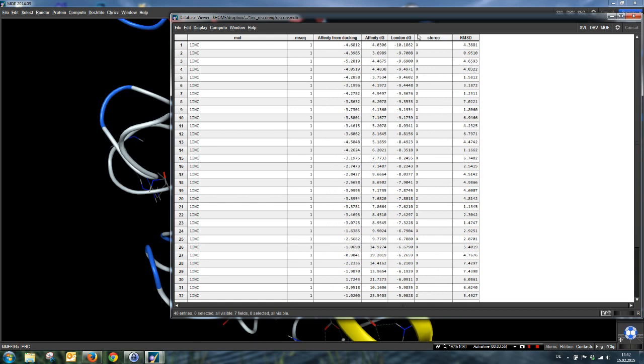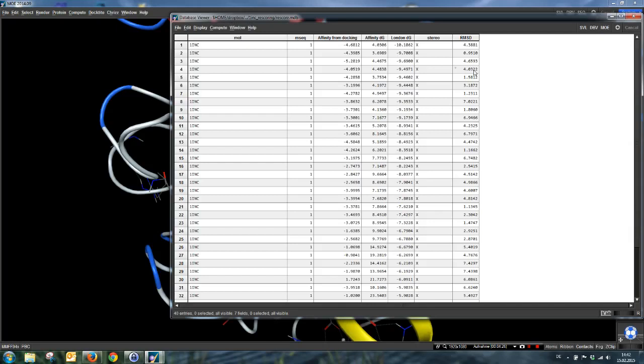Now the database is sorted regarding the second scoring function, the London DG score. And you see, the top one pose is not really near-native, it has an RMSD of over four angstroms. Just the second one is really the nearest native pose. And after that, there are again poses with RMSD values pretty much above the limit for a near-native pose. That empirical scoring functions really have problems with prediction of near-native geometries is not unusual, that's totally normal.